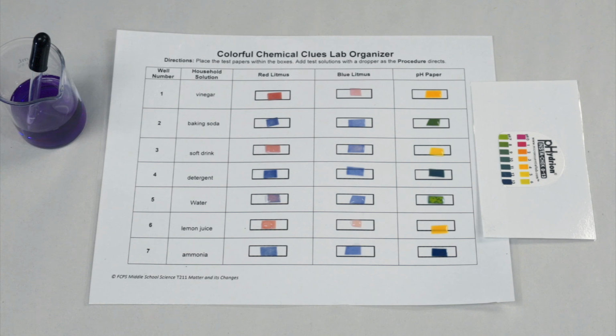You will use this image to fill in the data table columns 4 to 6. Please note that for the pH paper column, you need to put the color and the number you think that color best corresponds to, according to the pH scale to the right.